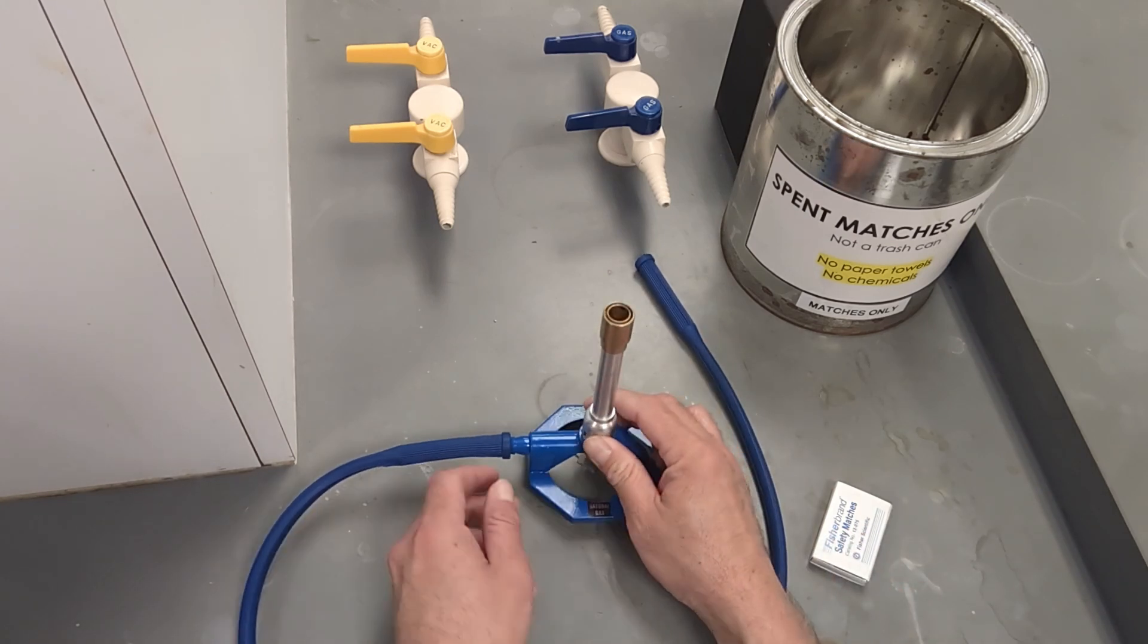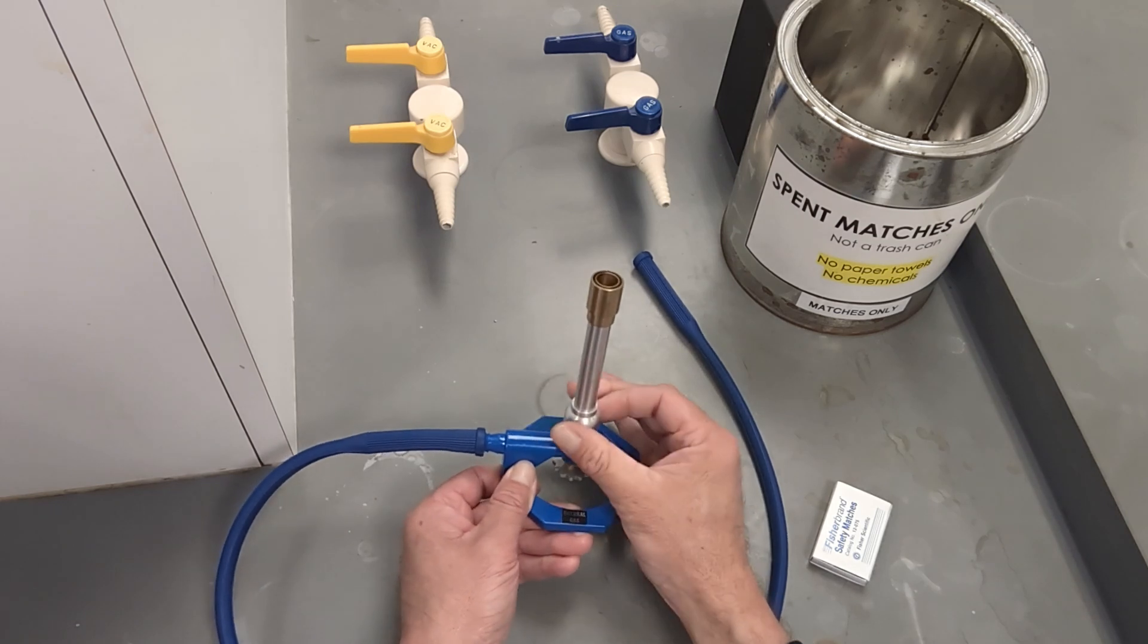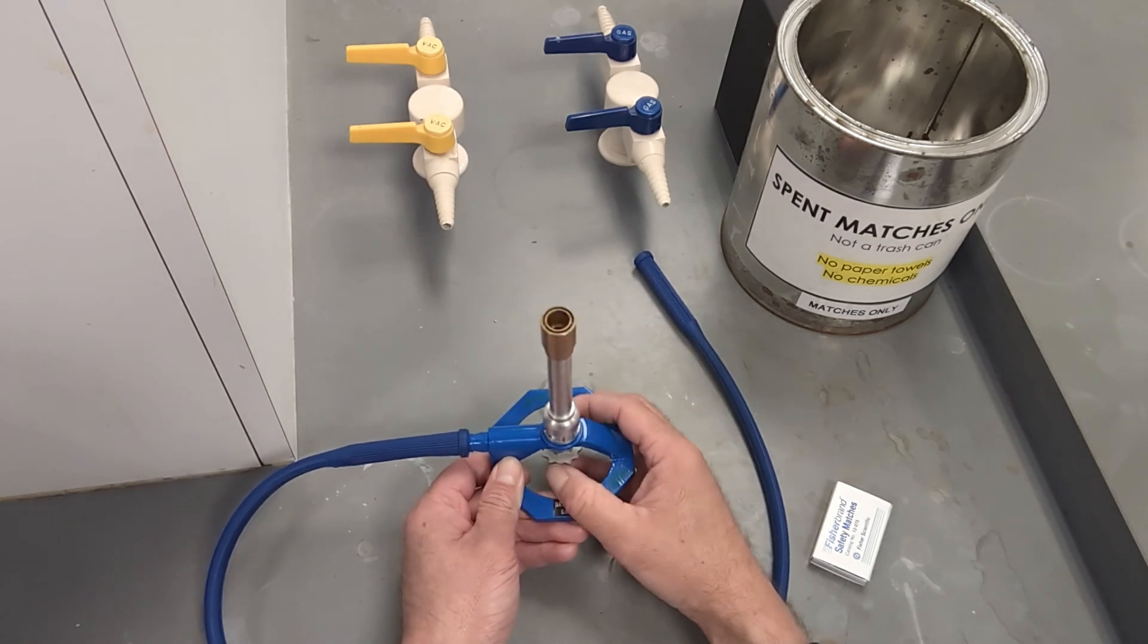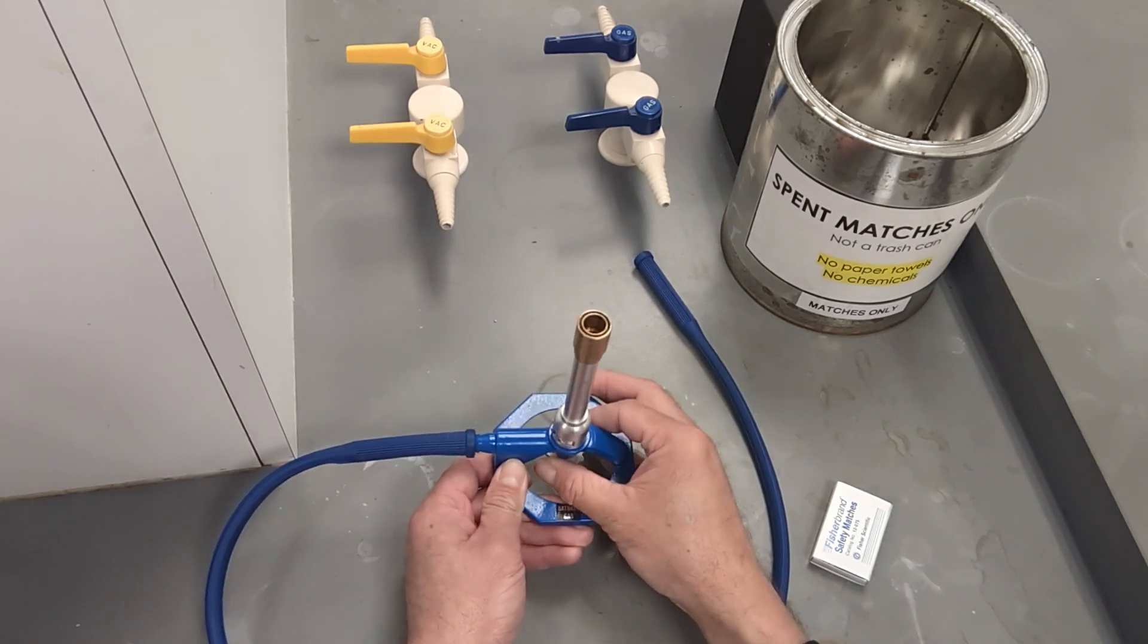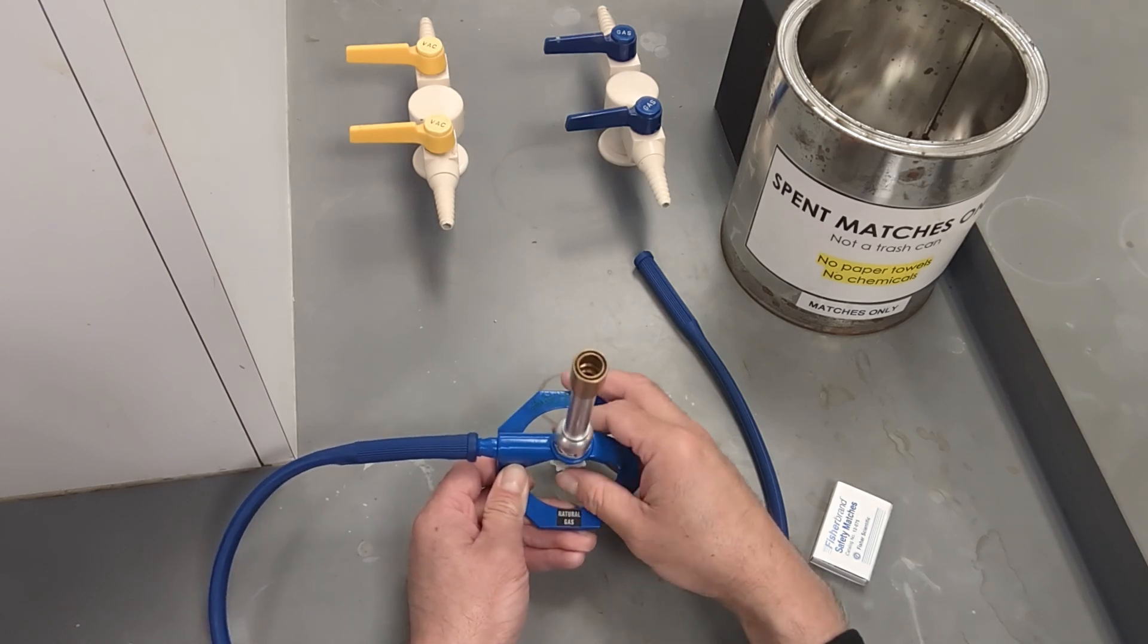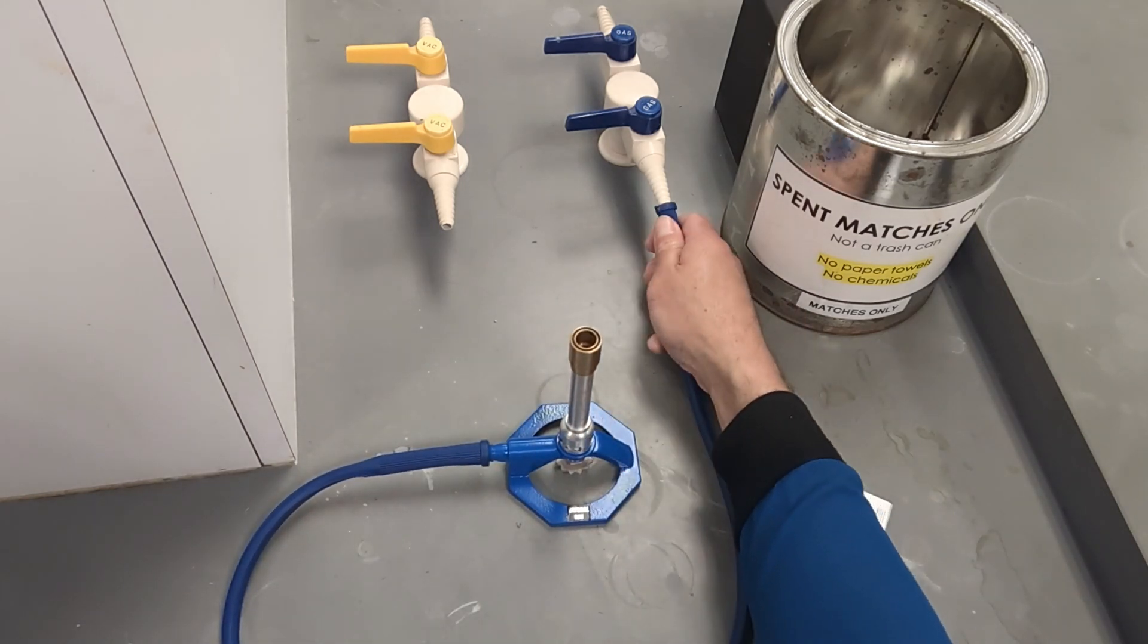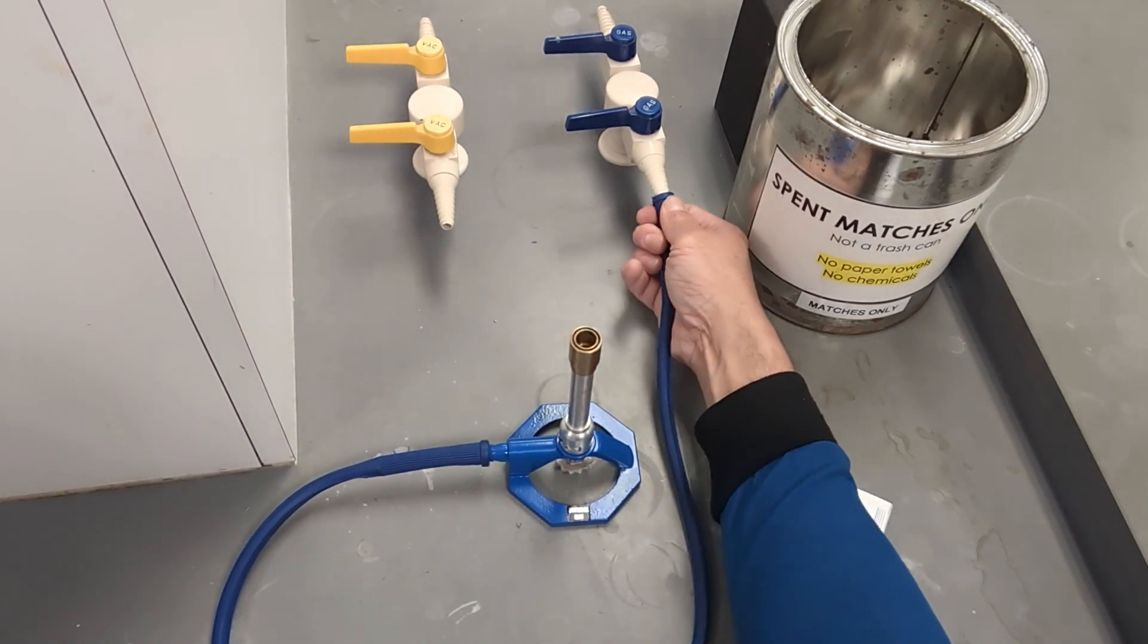So now we are ready to begin. We have our Bunsen burner that we are going to slightly loosen both the collar and stopcock, and we are going to go ahead and attach the hose to our gas line.